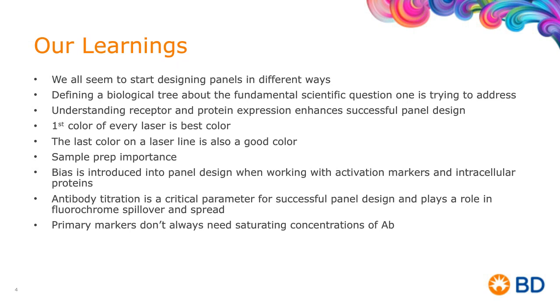So it's clear that we all seem to start designing panels in different ways, and truly that's okay. In our steps through this process, though, many of us do take the time to draw out a biological tree that lays our foundation.